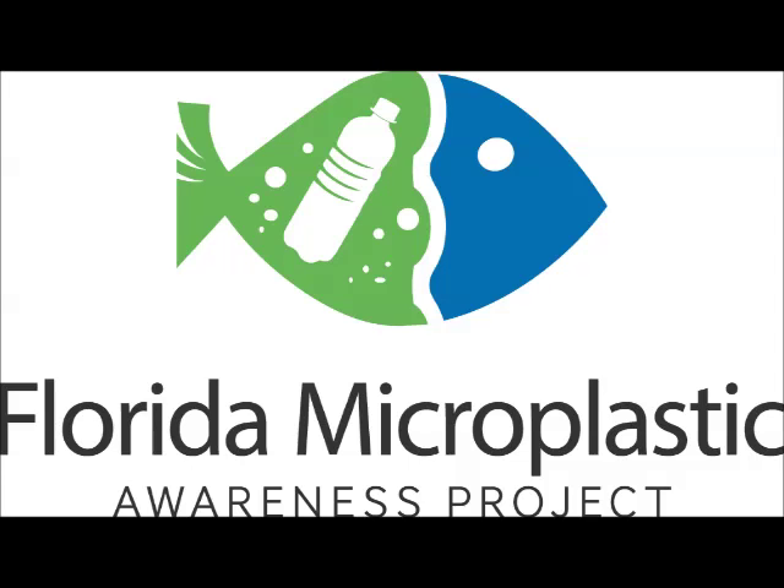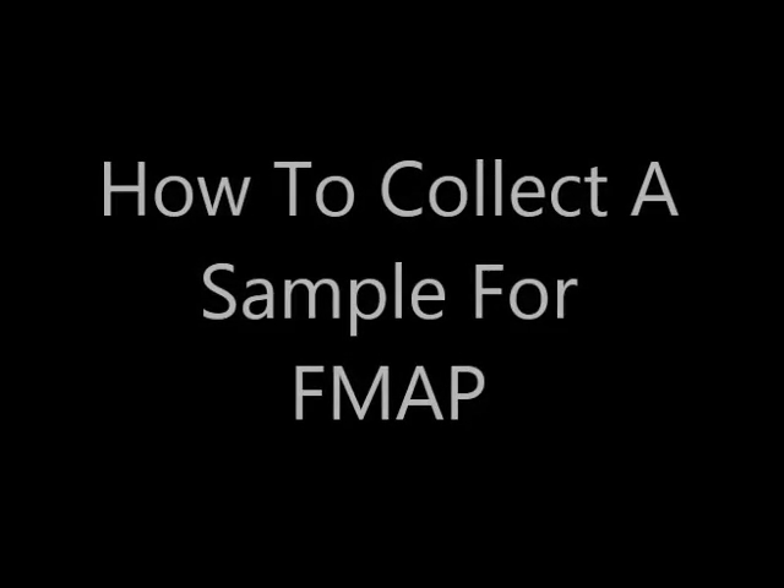Welcome to the Florida Microplastics Awareness Project. This short video is going to show you how to collect a sample for FMAP, or the Florida Microplastics Awareness Project.